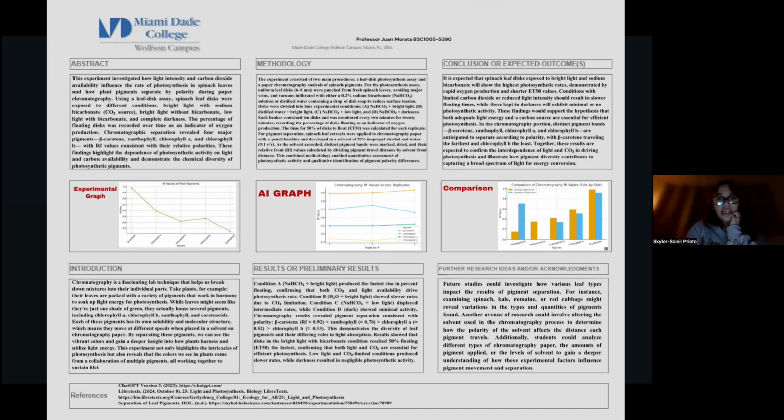Methodology. The experiment consisted of two main procedures: a leaf disc photosynthesis assay and a paper chromatography analysis of spinach pigments.